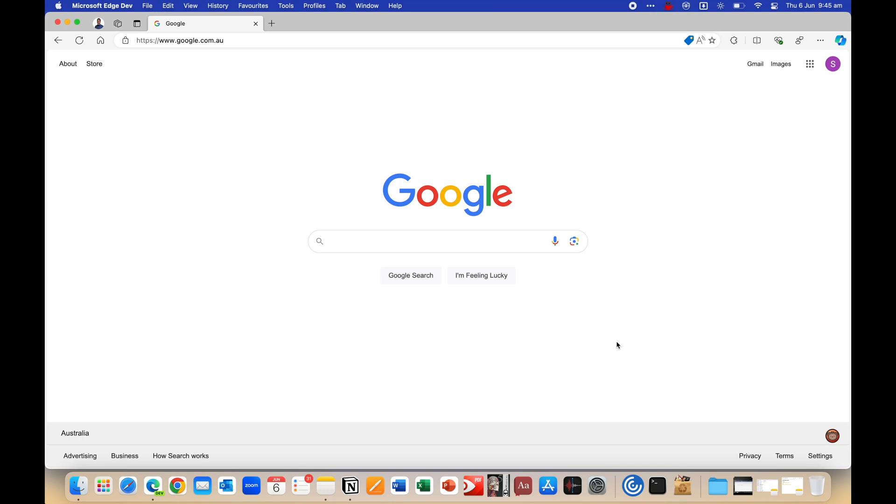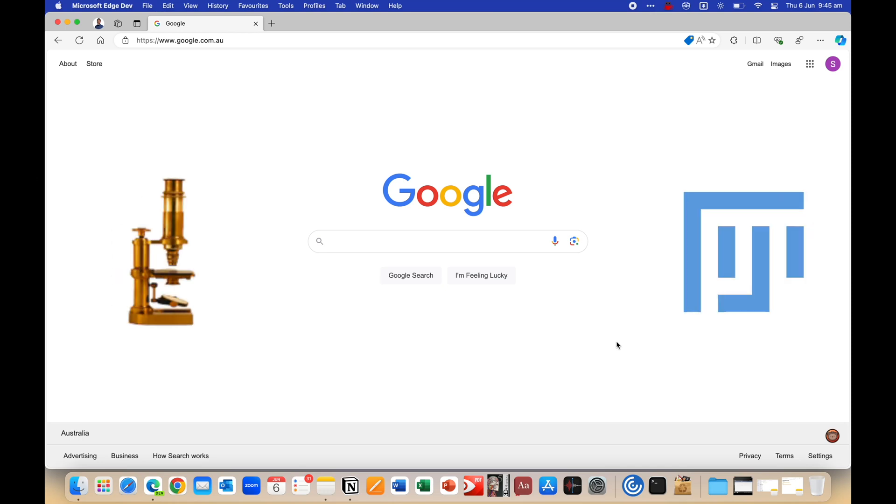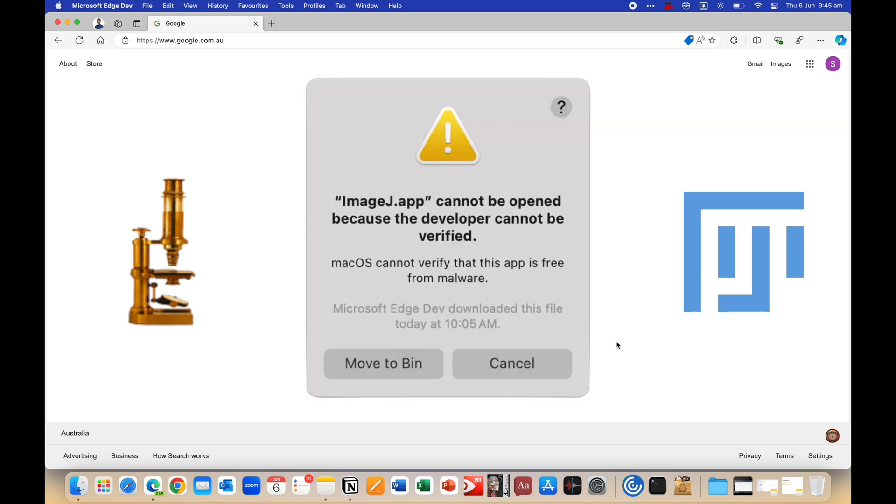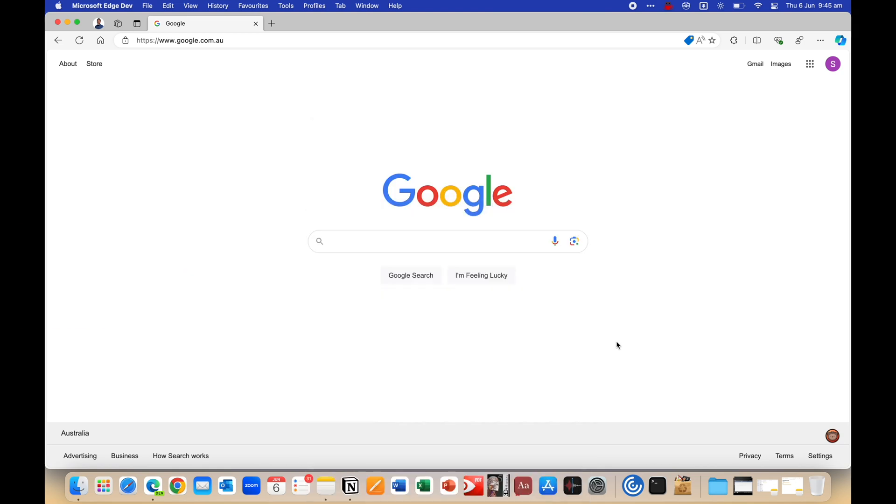Hey friends, so this is a very quick tutorial on how to download and install ImageJ or Fiji on your system. If you clicked on this video, you've probably seen this error sign. It's very annoying, but don't worry, there's an easy fix.